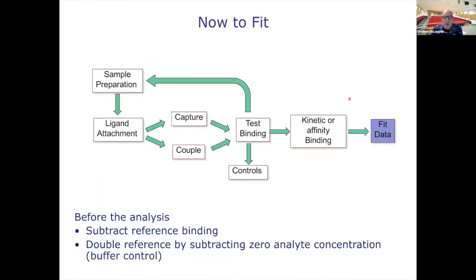Okay, so to fit the data, you're going to subtract your reference channel data, and then double reference by subtracting the zero concentration of the buffer.